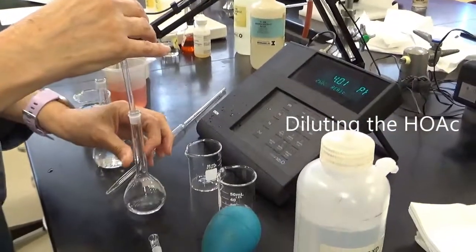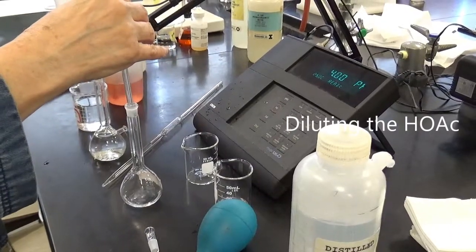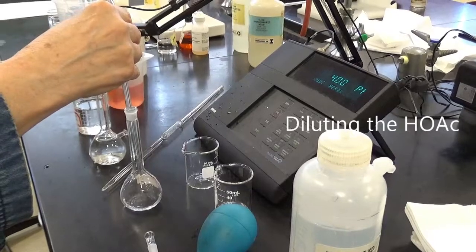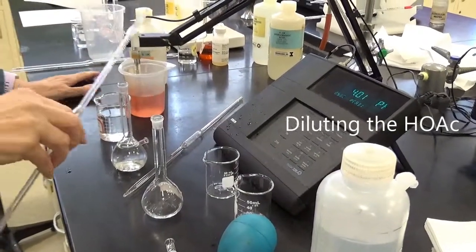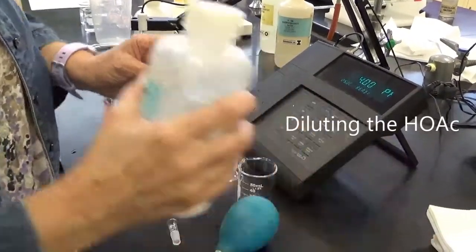Still coming out. All right, just leave the last drop. And now I dilute it.